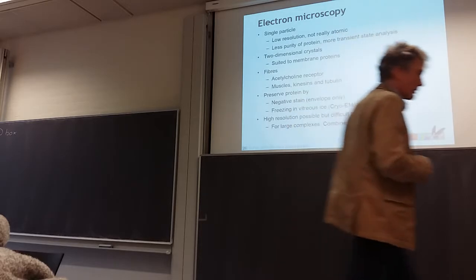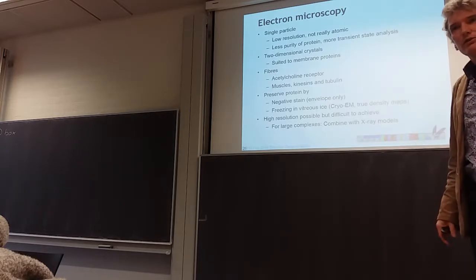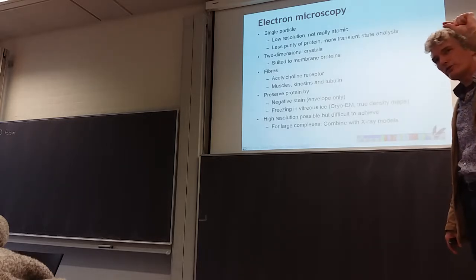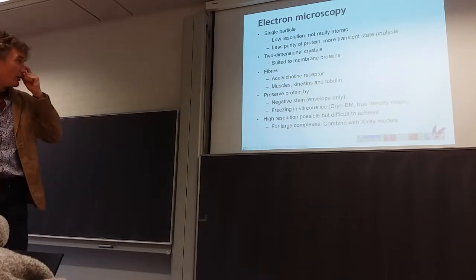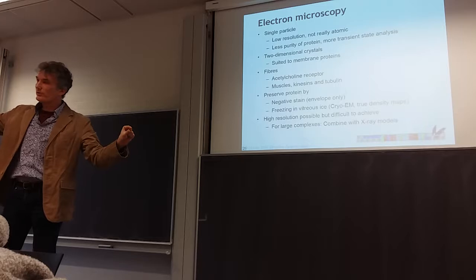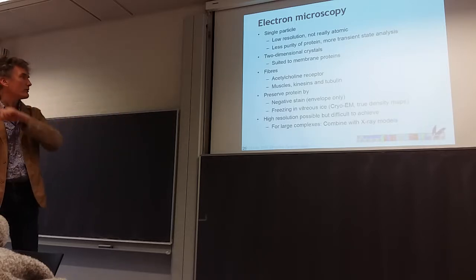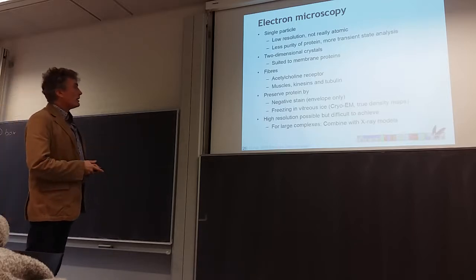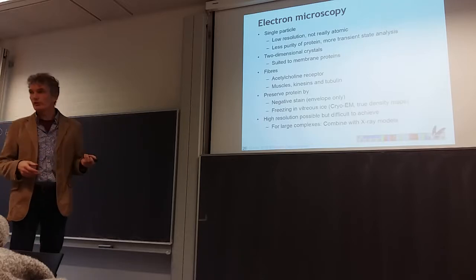You can do a similar thing for fibers, actually, if you're lucky. A fiber is like a 1D crystal. So if you have a clear enough picture of a fiber, you can get high resolution data on a single unit of your protein fiber by doing the Fourier transform trick along the length of the fiber. High resolution is possible, but it's still difficult.